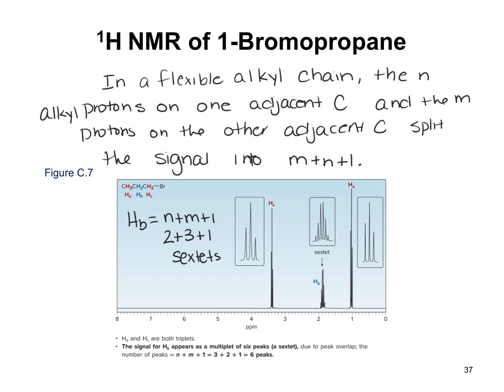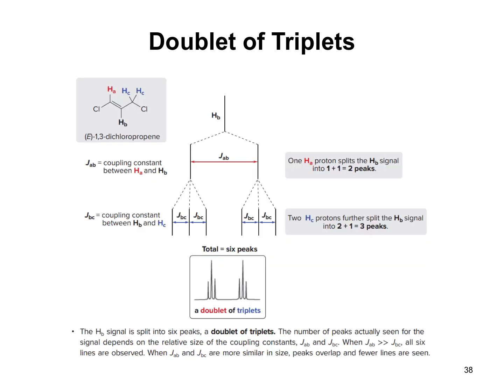Now, let's look at an example where the absorbing proton is flanked by 2 sets of adjacent protons, where one of those is bonded to a ring or a double bond. And this is where we're going to see something different. So when we look here, right, what you have is this guy here, this HA, okay, and the HB here, and then the HCs here. Okay, so we've got 3 protons. This is the only one where there are protons on 2 sides. So that's what we're really going to focus on and talk about, is this guy right here.